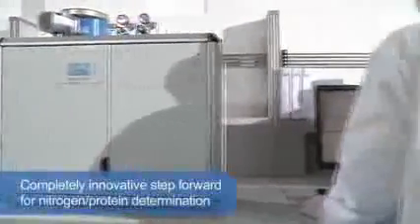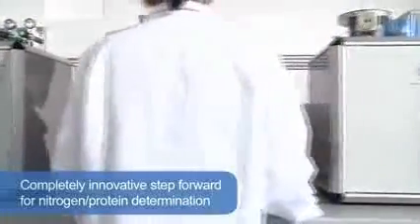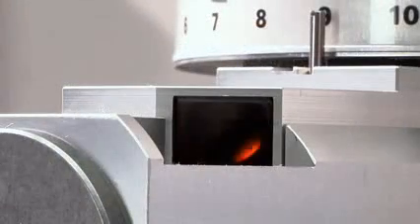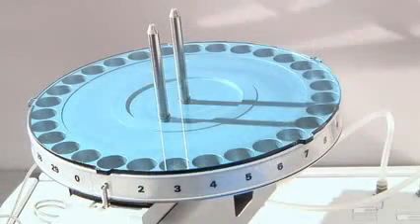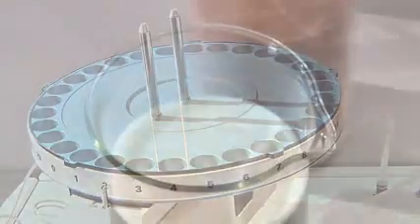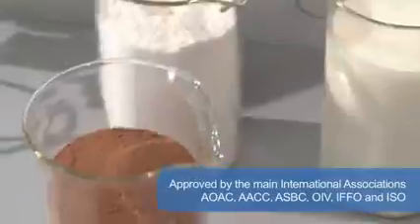The VELP Scientifica NDA701 Nitrogen Dumas Analyzer is a completely innovative step forward for nitrogen and protein determination using the Dumas technique, also known as the combustion method, offering excellent performance on liquid, paste and solid samples. Simple and fully automated, the VELP Dumas Nitrogen Analyzer is ideal for numerous applications such as food, beverage, environmental, chemical and pharmaceutical testing.